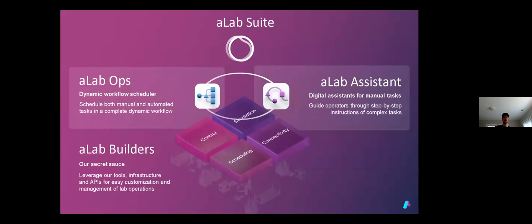We then batch these requests, either automatically based on metrics provided by the user, or by allowing the user to manually select which requests to run. The user can then schedule individual requests or batch requests. These requests include all the manual and automated work that is required for a particular process.